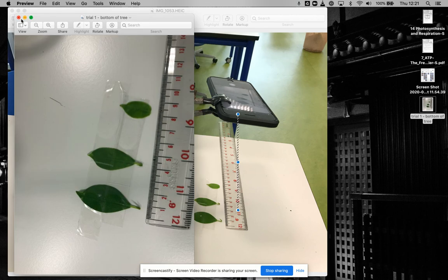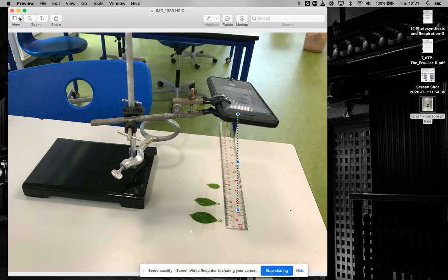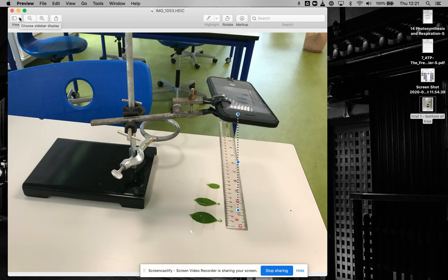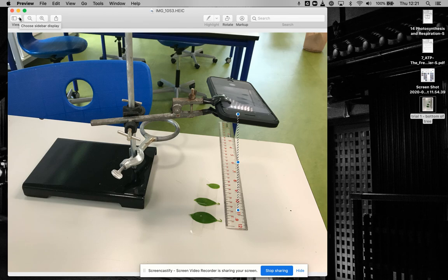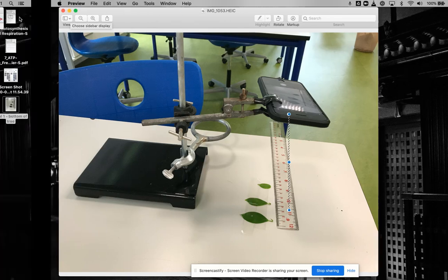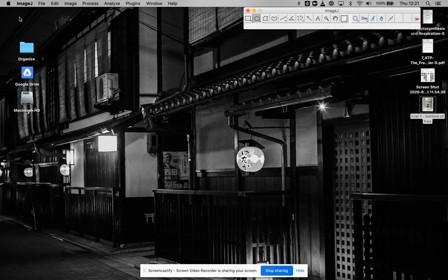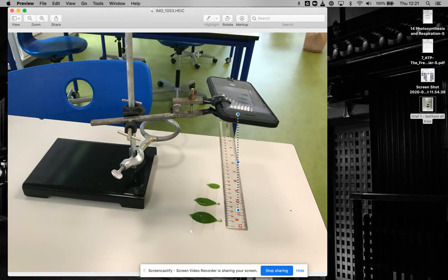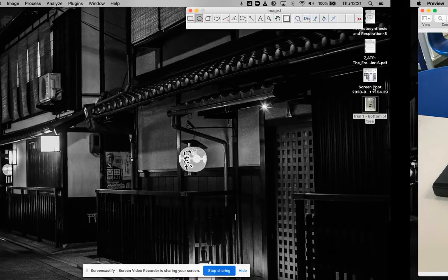Make sure it's a JPEG for ImageJ. If you're using something else, especially the photos that come straight from the Apple phone, it generally doesn't work. Once you've collected your pictures, you can start analyzing your data.